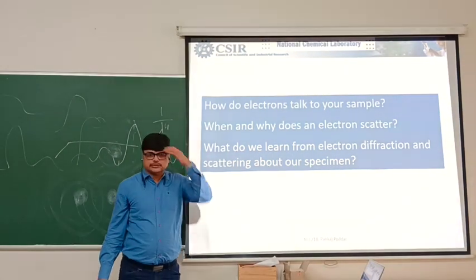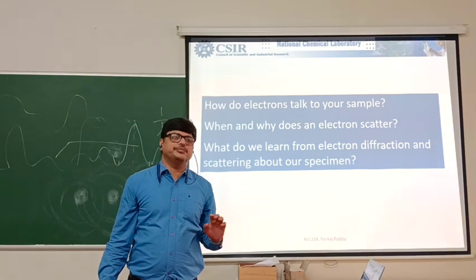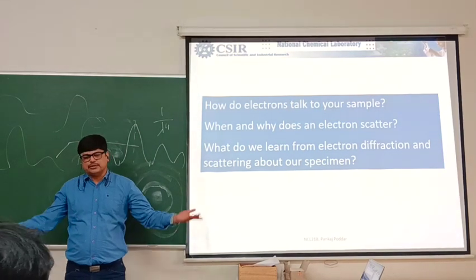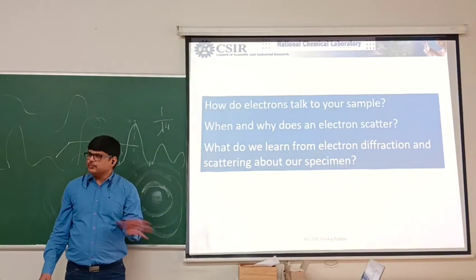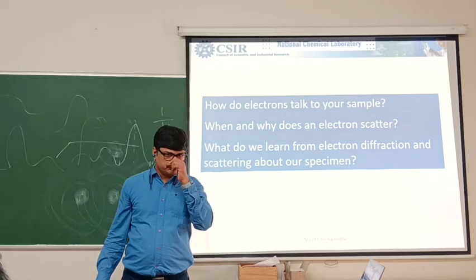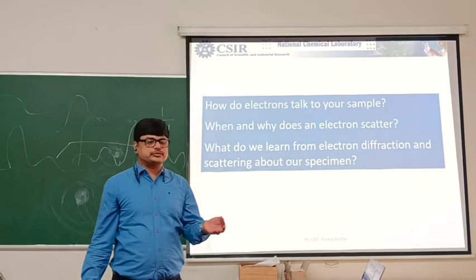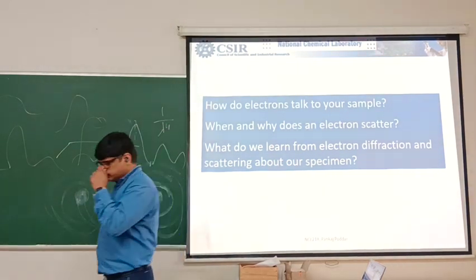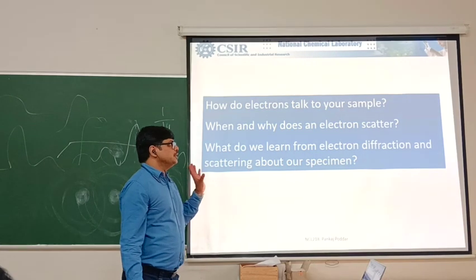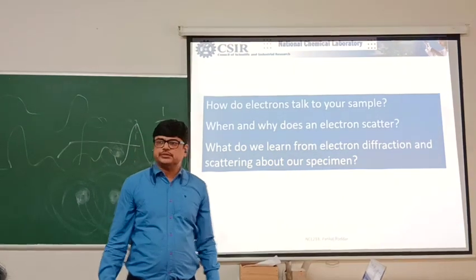And trust me, as a teacher, these three questions are beyond electron microscopy. You might be wondering why I need to learn so much for electron microscopy? No, not at all. You will learn about XPS here, X-ray photoelectron spectroscopy. You will learn Raman in this class. You will learn about EDX, XRD, everything will be covered here, right? Because, for example, you already answered about X-ray diffraction in the assignments.